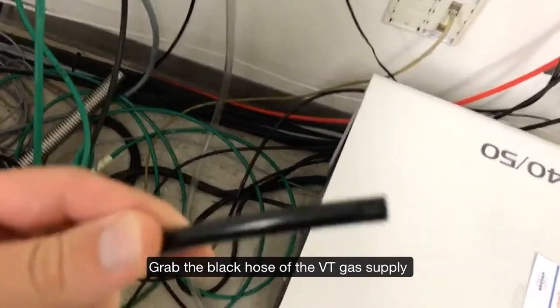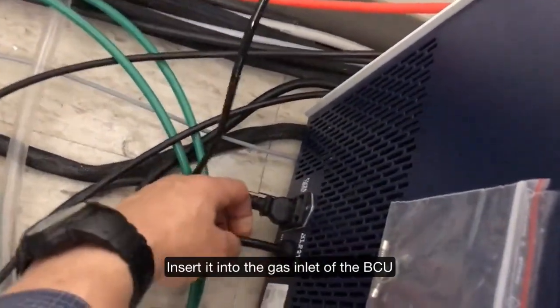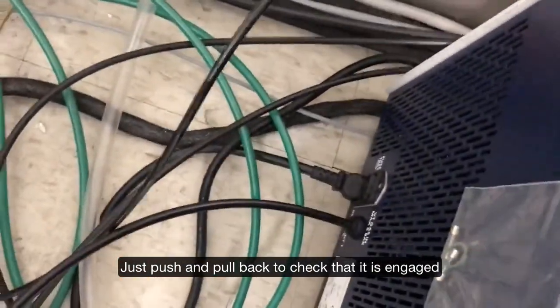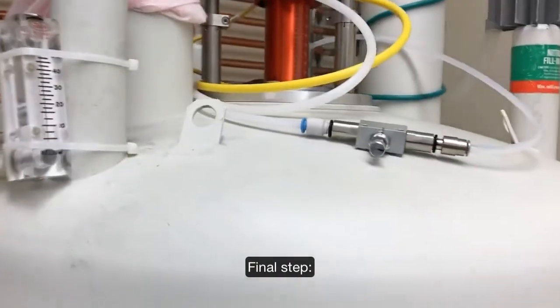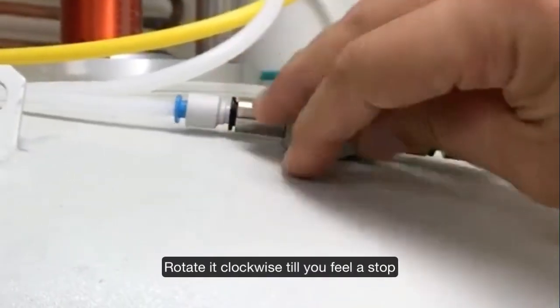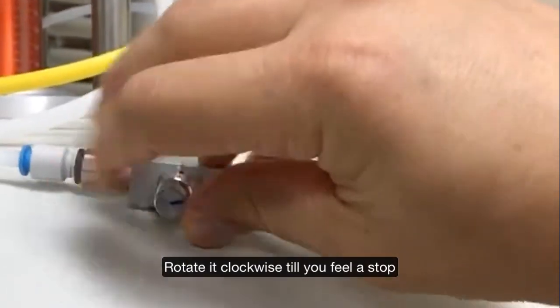We are going to connect this fitting and it will go straight in here. Just push it in and then pull to check that it is securely in place. The final step is to close the shim gas valve. All you need to do is fully close it by rotating clockwise.